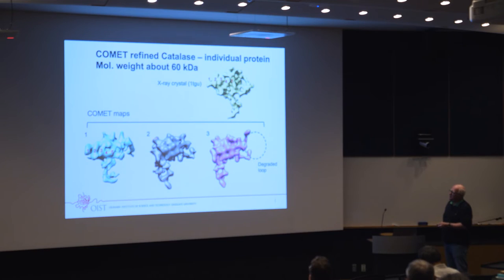And to my horror, I realized that even if you get to high resolution on these individual ones, the dose shoots away randomly in these particles. So the curation of all this is what single particle people had already figured out a long time ago. You average. If you average many of them, the error where the electrons have shot away some part of the structure gets averaged out.